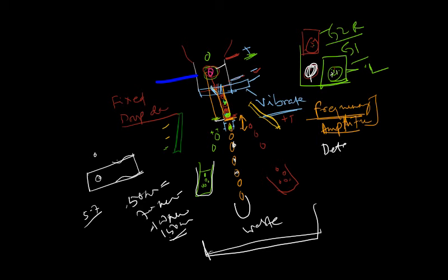So here these are the detection, decision, and deflection, and finally collection. This is how it is performed.